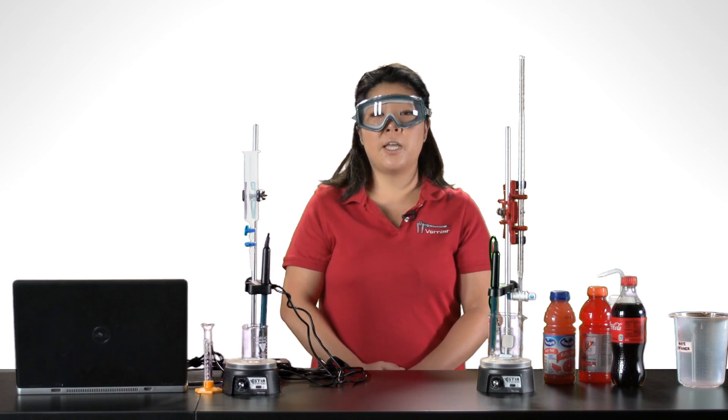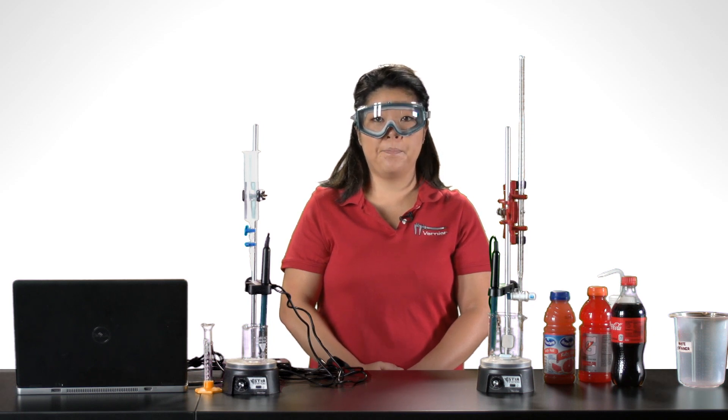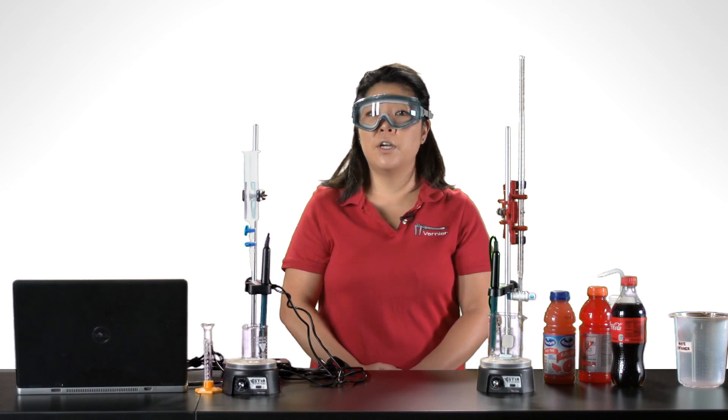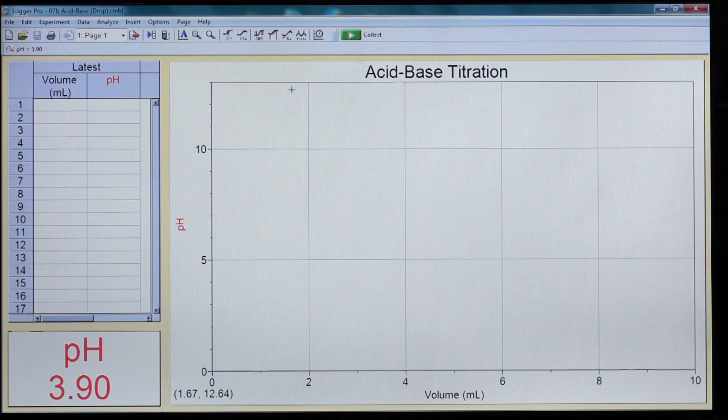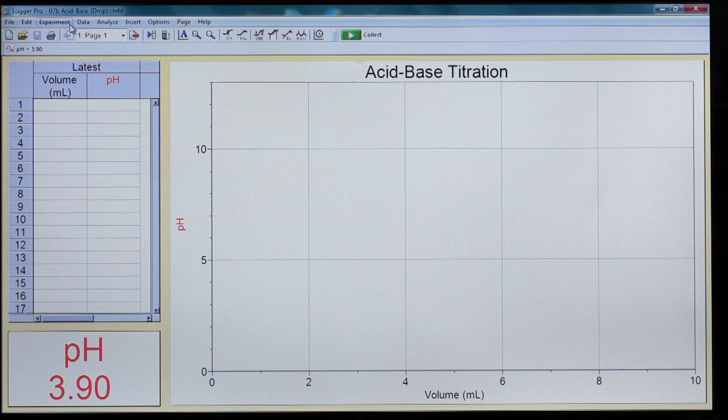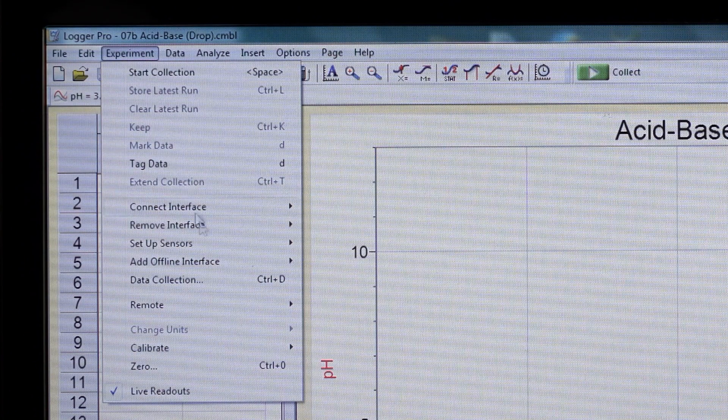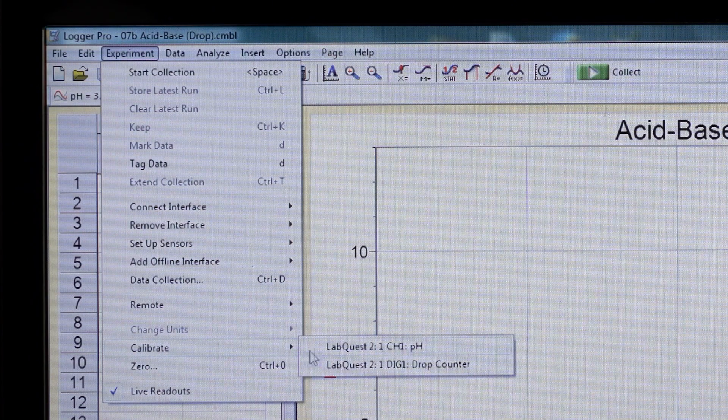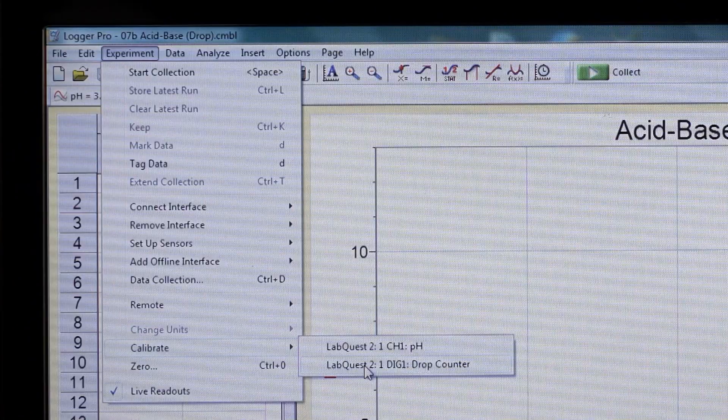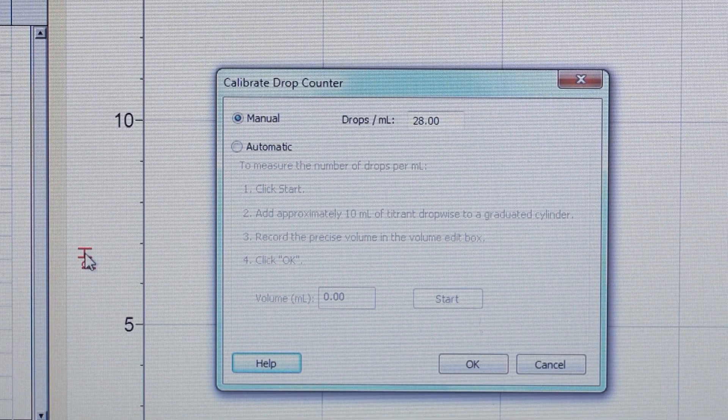The first step is to access the calibration option for the drop counter in your data collection program. In Logger Pro, choose Experiment, then choose Calibrate, and choose Drop Counter. And follow the instructions on the screen.